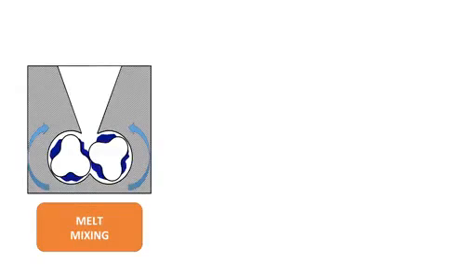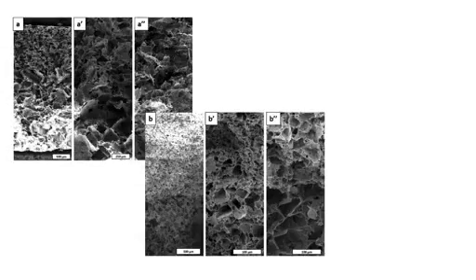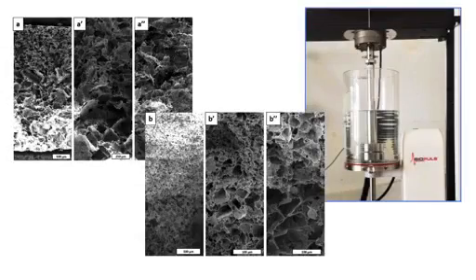In particular, the pathway proposed combines melt mixing, compression molding and salt leaching. Both the morphological analysis and the mechanical behavior of the structures were investigated, paying particular attention to the processing-structure-properties relationships of the prepared devices.